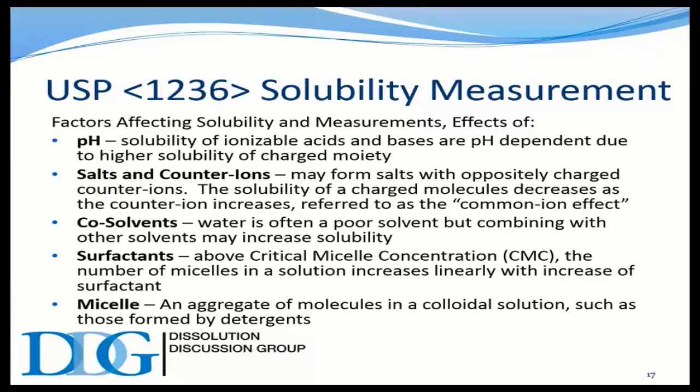Well, I'll just add to that. Sometimes the asymptote is essentially when the dissolution profile plateaus, and it's called an asymptote because it's not necessarily getting to 100%. It's more like 90%, but it levels off. This can happen sometimes when the matrix just won't let go of the API, and some is so tightly bound that it won't release.